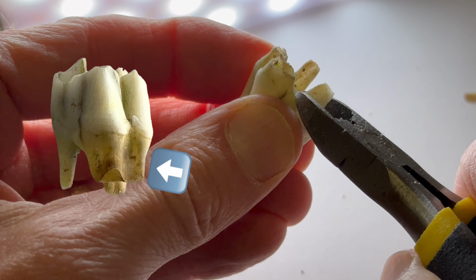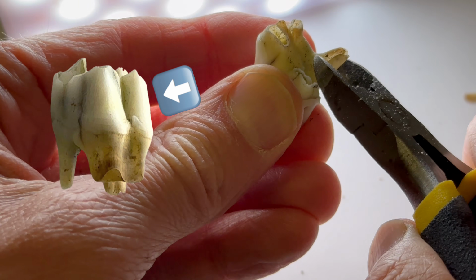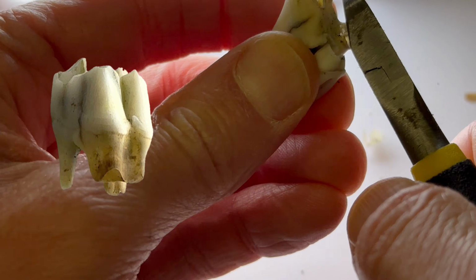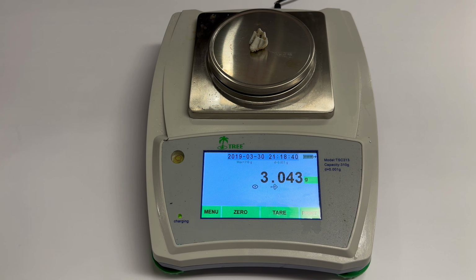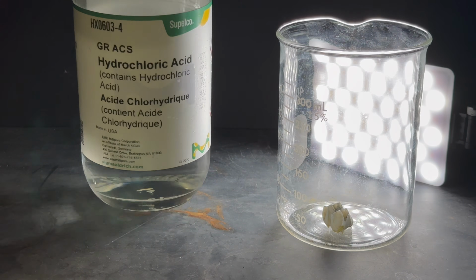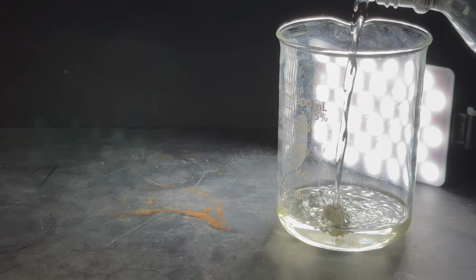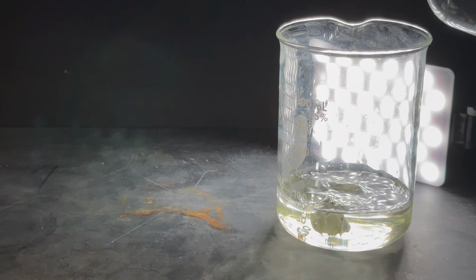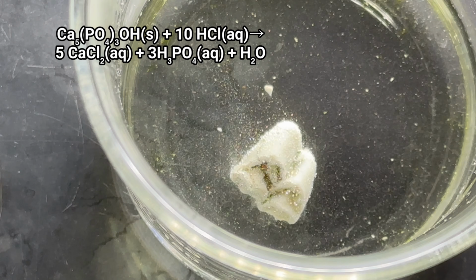The root of the tooth appeared to be made of different stuff than the top part of the tooth, so I did my best to remove all of the root material. And the mass of the top part of the tooth that I sampled was 3.043 grams. Next, I put the tooth in a beaker and added some concentrated hydrochloric acid. You know, stomach acid, except this stuff is hundreds of times more concentrated than the stuff in your stomach. I figured the acid would dissolve the tooth mineral, and this would release the calcium ions from the tooth.